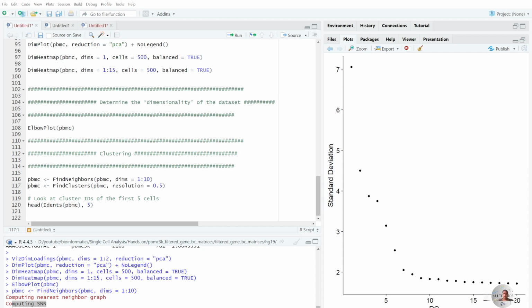And the graph was SNN, which is a shared nearest neighbor graph. In this, the edges are formed between the data points based on the number of nearest neighbors they share. It helps us to reveal the clusters in high dimensional data. It will help in locating the different clusters, and it is often performed only after dimensionality reduction.